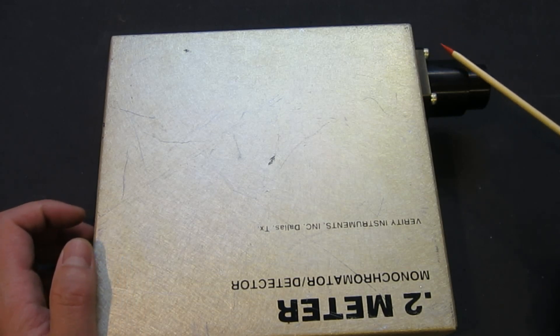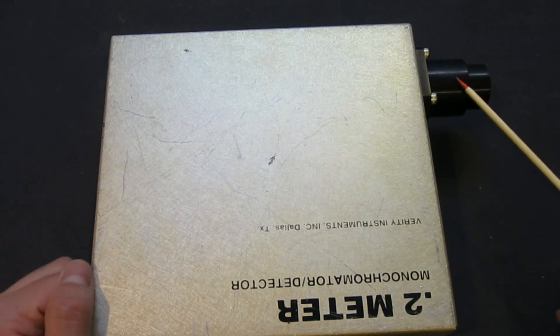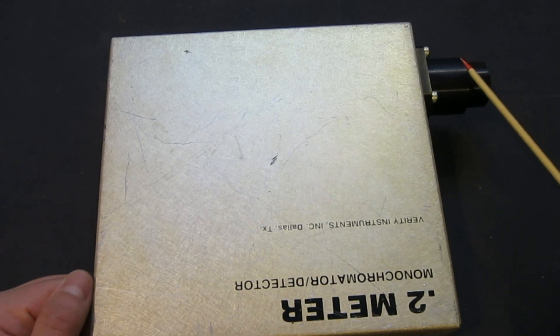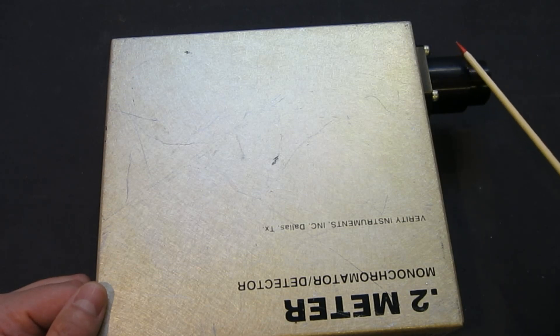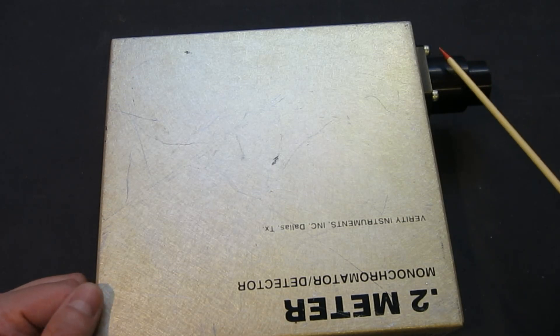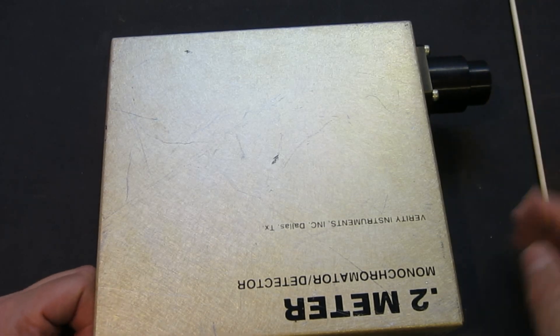I haven't tested that after the slit was installed, but it should be pretty decent for what I will be using it for. I'm not going to do any very precise measurements, but that will definitely do the job.